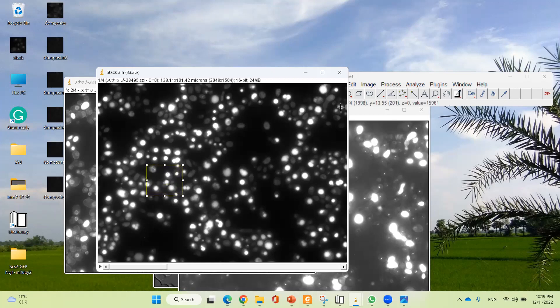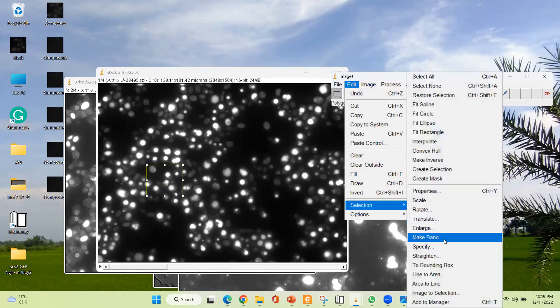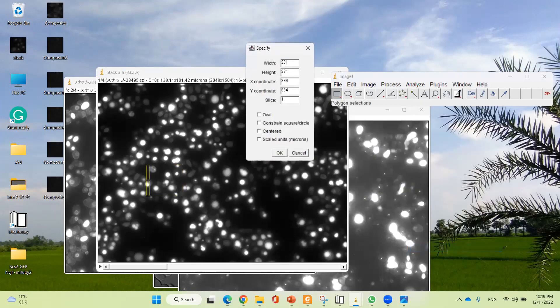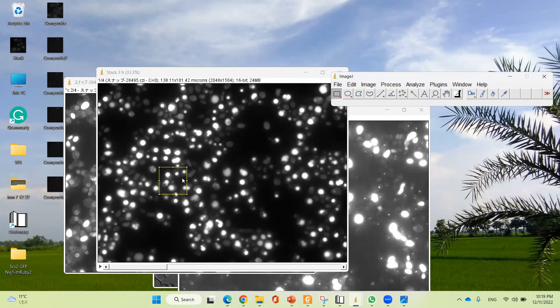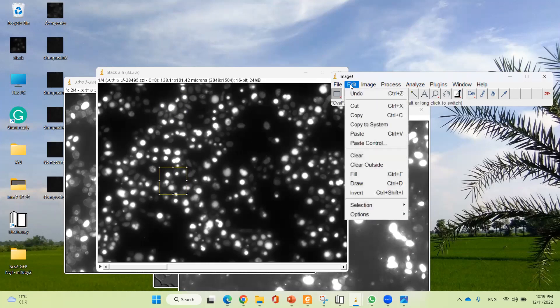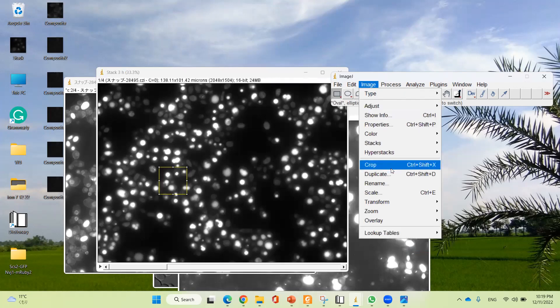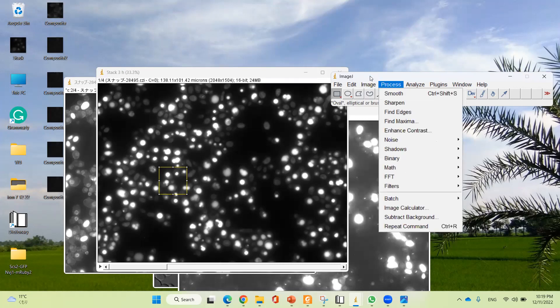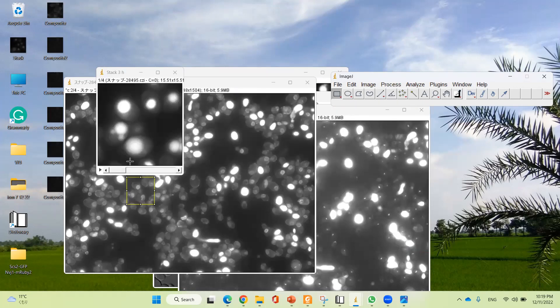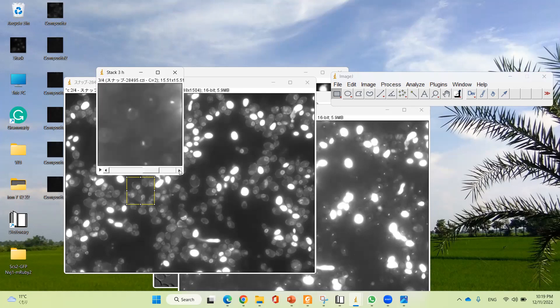I'm going to select a region and specify it by clicking on Edit, then Selection, then Specify. Remember the numbers: 230 for width and height, 502 for the X coordinate, and 702 for the Y coordinate. So the specific region has been selected. Click OK. Now to cut the image, you have to crop it using Control+Shift+X. The four images have been cropped into pieces.